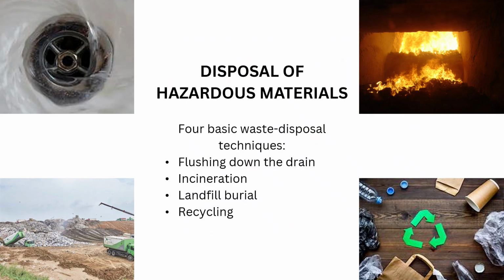The safe handling and disposal of chemicals and other materials require a thorough knowledge of their properties and hazards. Generators of hazardous waste have a moral and legal responsibility, as defined in applicable local, state, and federal regulations, to protect both the individual and the environment when disposing of waste. There are 4 basic waste disposal techniques: flushing down the drain to the sewer system, incineration, landfill burial, and recycling.